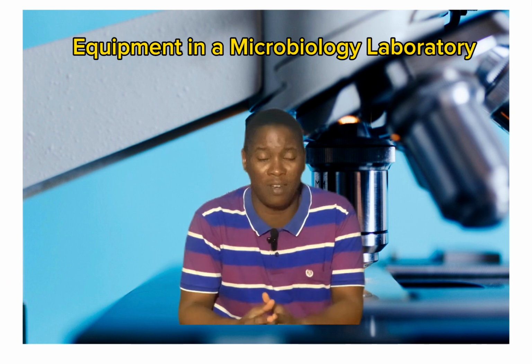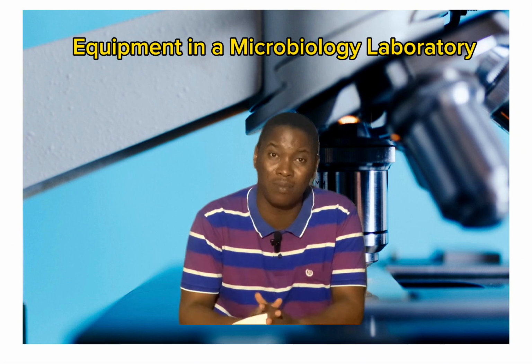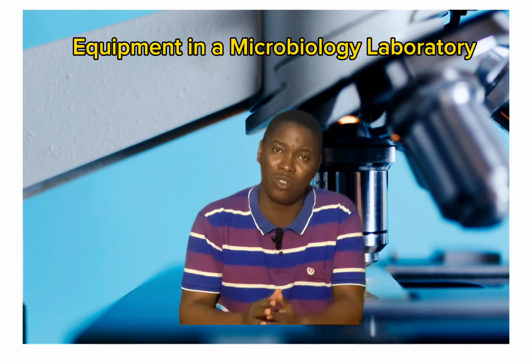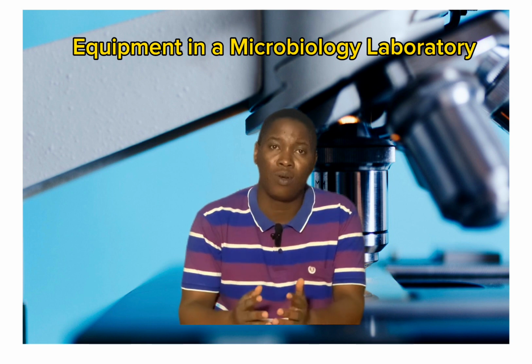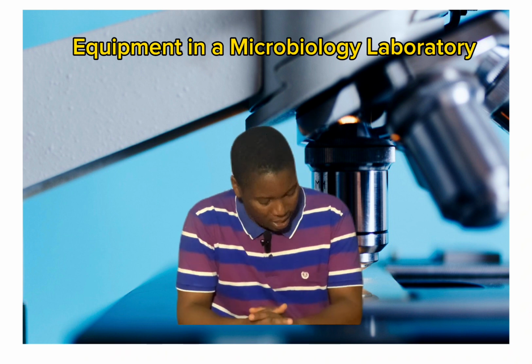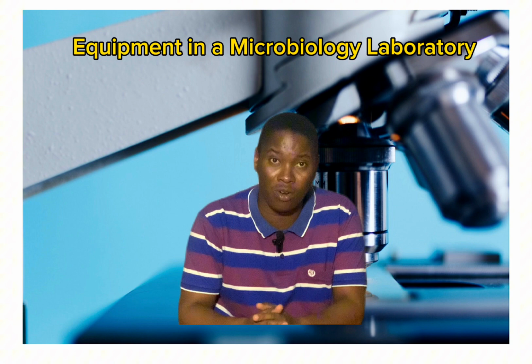Petri dishes are very, very important. Some of them are usually 10 to 11 centimeters wide and 1 to 1.5 centimeters high. The microorganisms are grown in these dishes. They are particularly of importance in the microbiology lab.